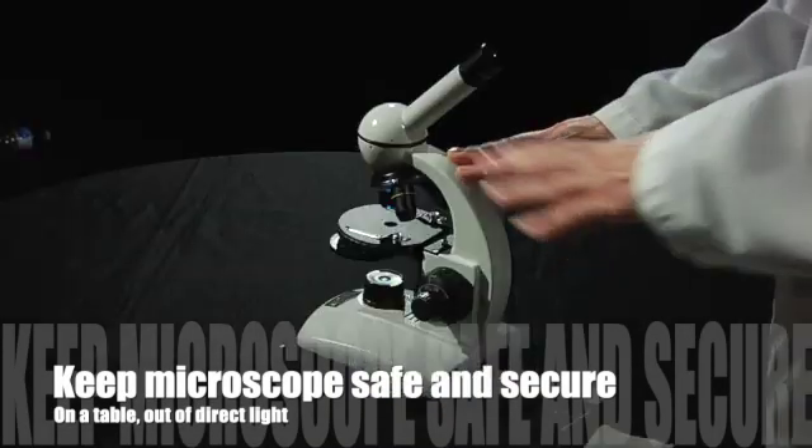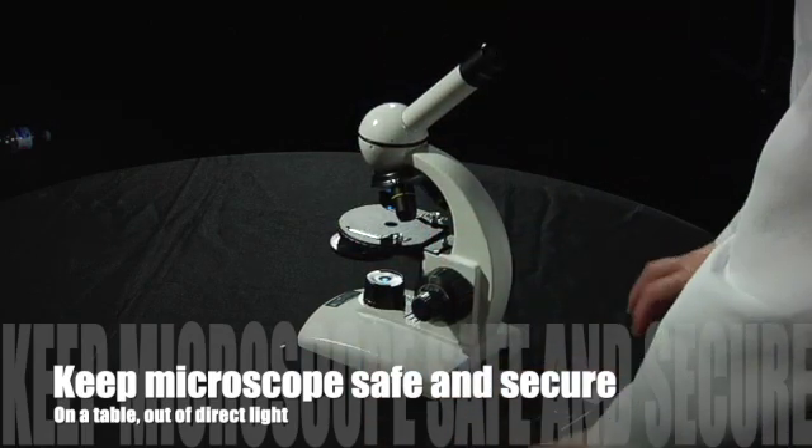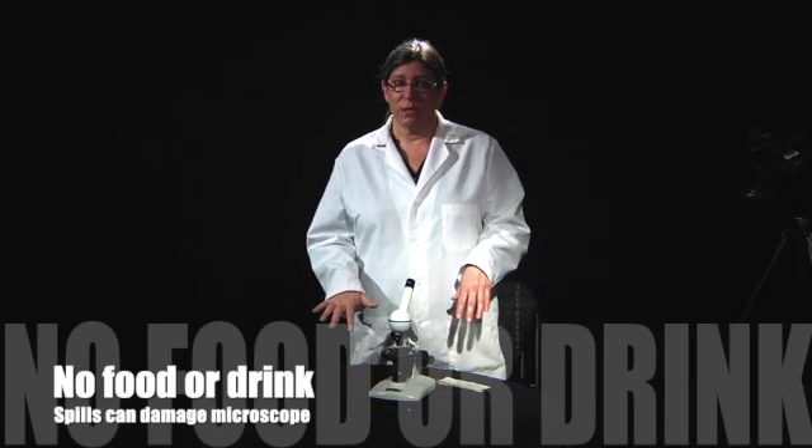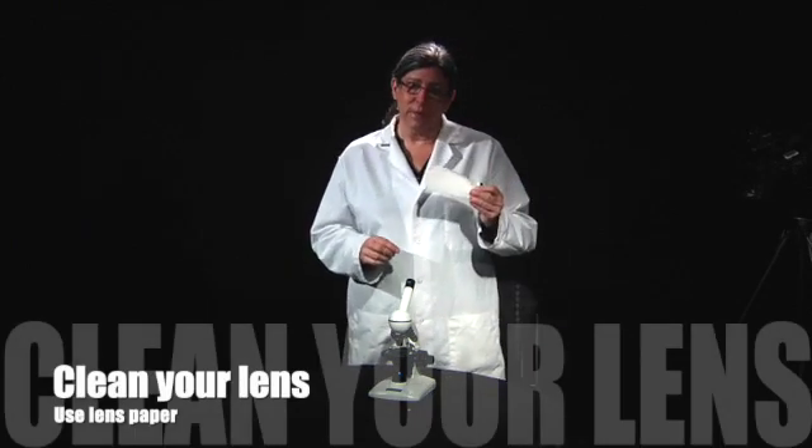Now that you're ready to use your microscope, you need to make sure it's in a secure and safe location away from direct light. You want it to be on a solid table, not on books or anything underneath it. You shouldn't have any food or drink around the microscope because if you spill it could damage the microscope. Once it's in a safe place, you might notice some dust or fingerprints on the lens — that's normal after use, but we don't want that there. You can clean it off with some of the lens paper that comes with your kit.